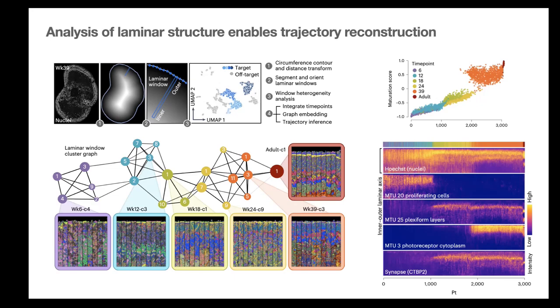That's what we see. And what we're doing now is mainly my part here, that I developed this algorithm called Laminator, because we laminated stuff. On the outline of the organoids, we place rectangles oriented to the center of the organoid.